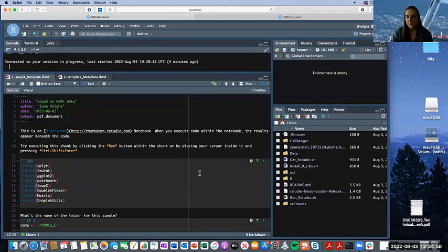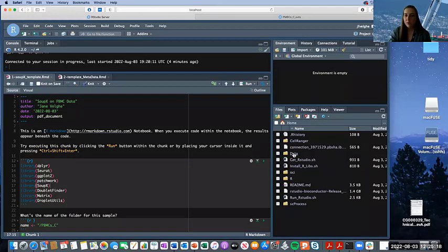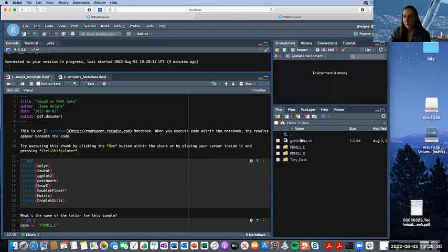And the first thing we're going to do is in your directory here, you should see SC process, and then you should see the other folders that you were familiar with from this morning. So data and cell ranger. So first, let's just pop into our data folder and look at our cell ranger outputs. So data, and now we're going to go to PBMC C data set.